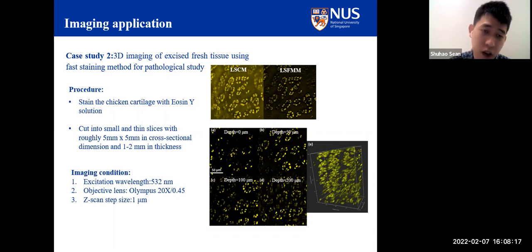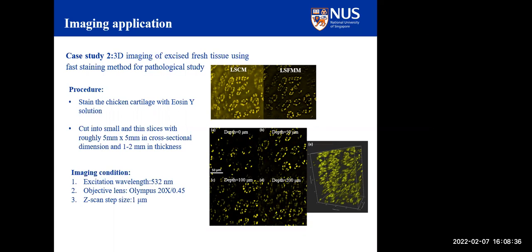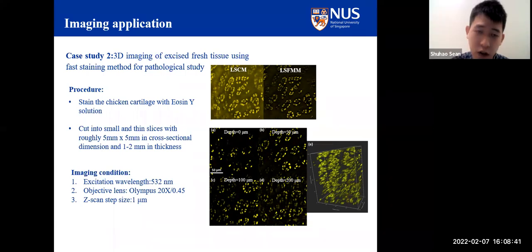Yeah, there are many samples for applications. Usually the most frequently used is the zebrafish. That's why the light sheet microscope is really popular, because the zebrafish is a relatively transparent animal. But when it comes to other types of animals, a tissue like the mouse brain, if you want to do live imaging, it will be relatively difficult.